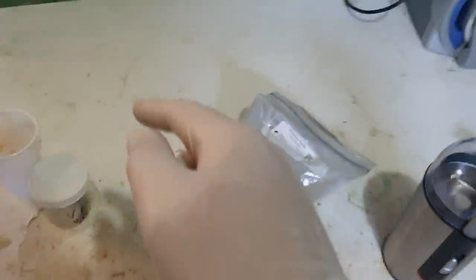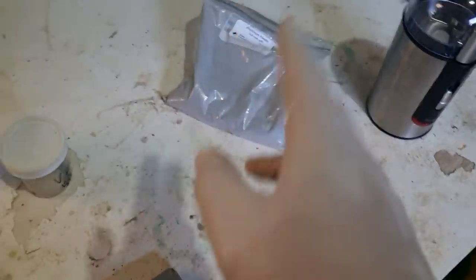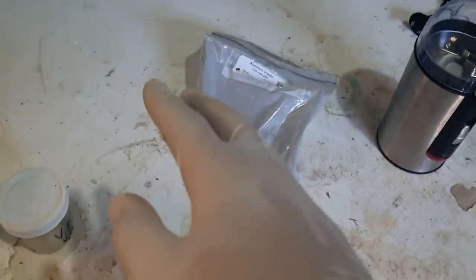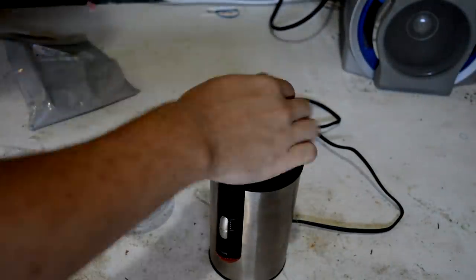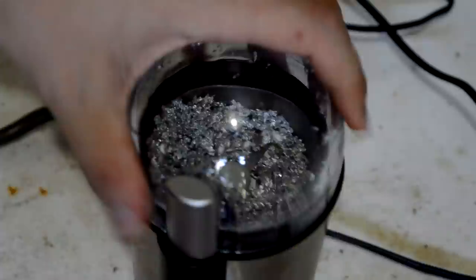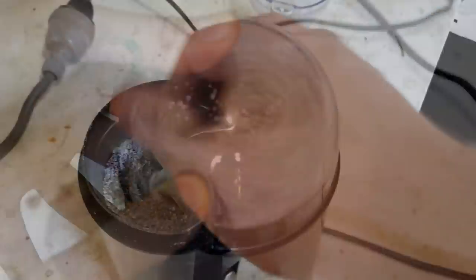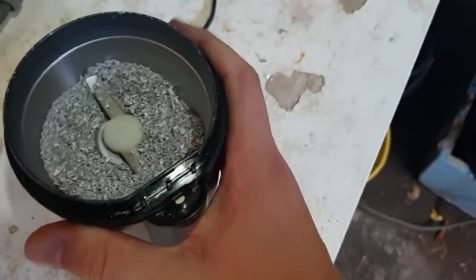Usually this doesn't work with thermites because you want it to be relatively fine, but seeing as we don't want it to be fine — we want it reasonably coarse to slow down the speed of the reaction — I think that might work. Alright, we're making progress, although this kind of grinding makes the thing very hot, so we're going to let it cool down.